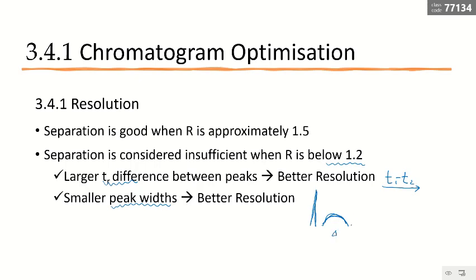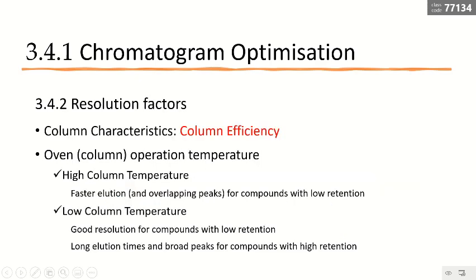This fat one is sometimes called a hump shape. So you know this is the direction we are going to see. We know we want a better resolution, but how do we do it? Commonly for gas chromatography, there are two parameters we consider.